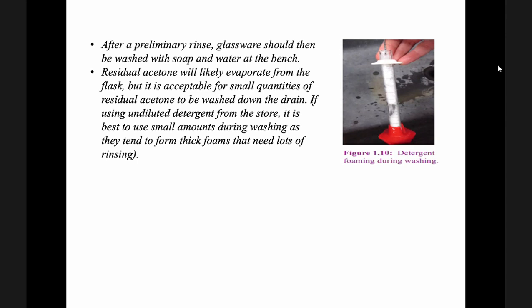Then you must find a waste treater to collect your chemical waste. But for ordinary acids and bases, you can neutralize first before draining down the drain. And the same with acetone.